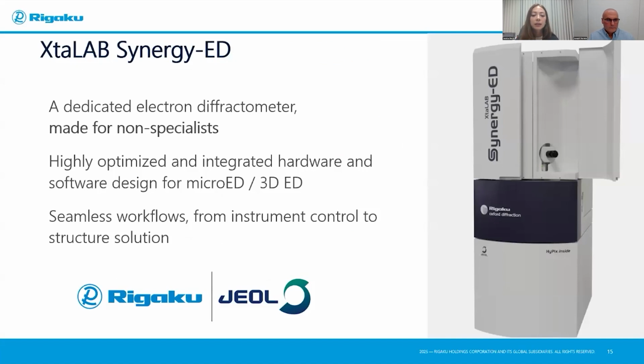And that's really the big motivation behind the development of the Synergy-ED, which is a collaboration between Rigaku and JEOL. And this is a dedicated electron diffractometer that is more catered towards non-specialists.